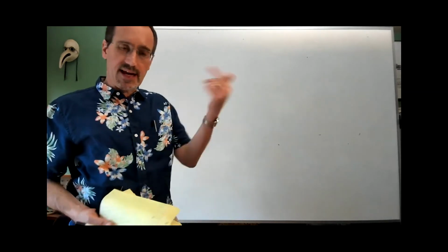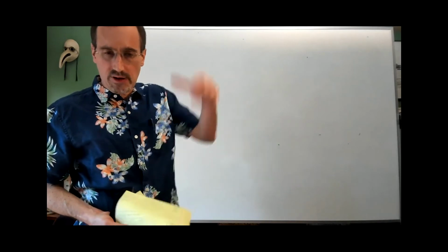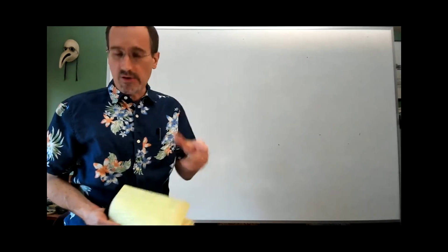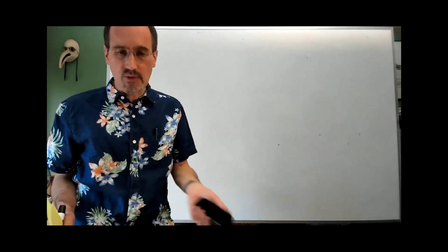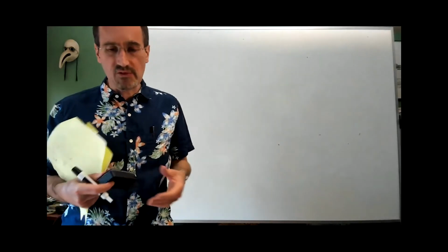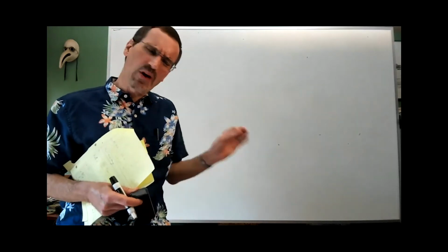And I say, wait a second, I see a double bond in the C13 NMR spectrum. I see a carbonyl in the IR spectrum. There are at least 2 degrees of unsaturation here. And maybe I count up the number of carbons from the C13 NMR spectrum, and maybe even the number of hydrogens from the proton NMR spectrum. And then I'll start to say, well, wait a second.